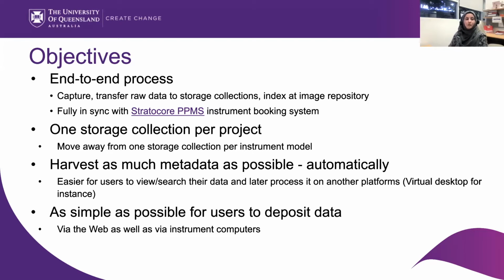And then the objectives which we dealt with during this design. What we wanted was, when an image comes out of a microscope, when it is captured, it should be transferred as raw data to the storage collection, which in our case was the RDMs, and then each image should be indexed within the image repository so that it is searchable later on. It should be completely synced with our booking system, because that's basically the controller to our instruments.